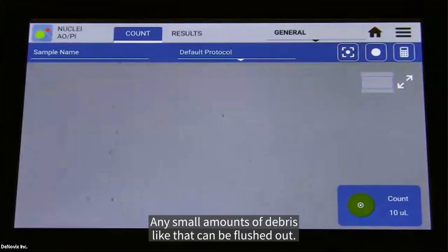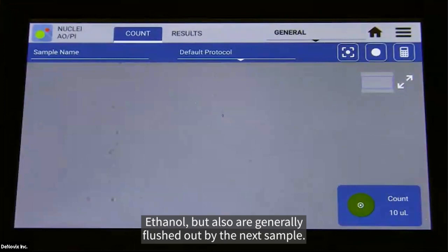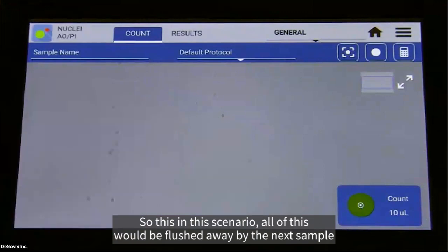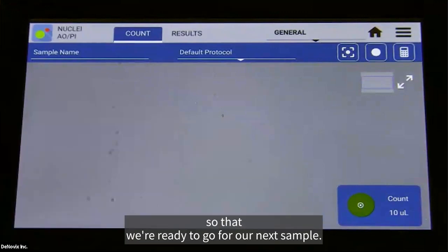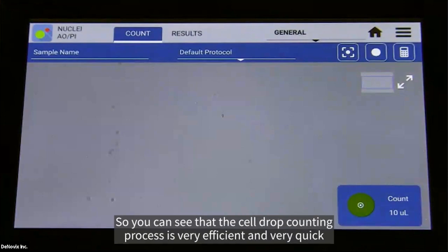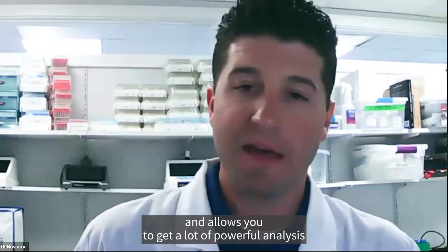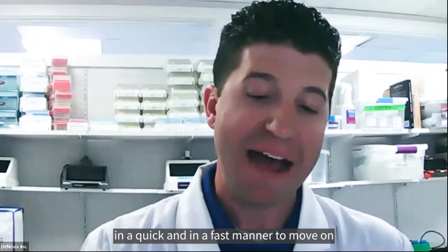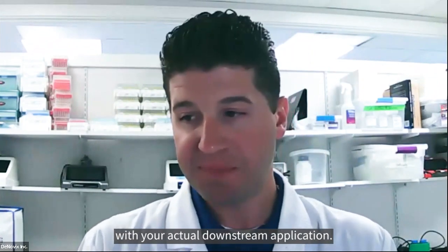Any small amounts of debris like that can be flushed out with ethanol, but also are generally flushed out by the next sample. So in this scenario, all of this would be flushed away by the next sample. So we're ready to go for our next sample. And if I wasn't doing a demo, we probably could have processed 10 samples by now. You can see that the Celldrop counting process is very efficient and very quick, and allows you to get a lot of powerful analysis in a fast manner to move on with your actual downstream application.